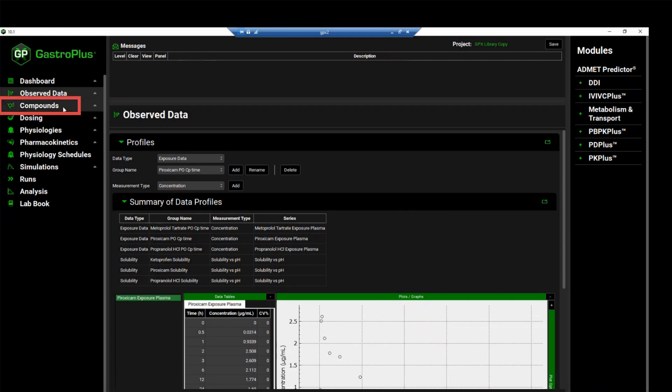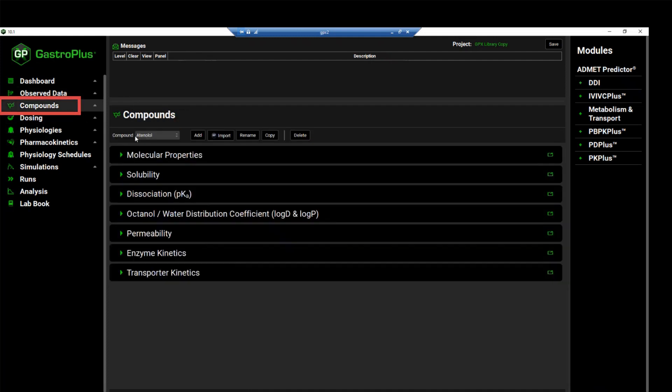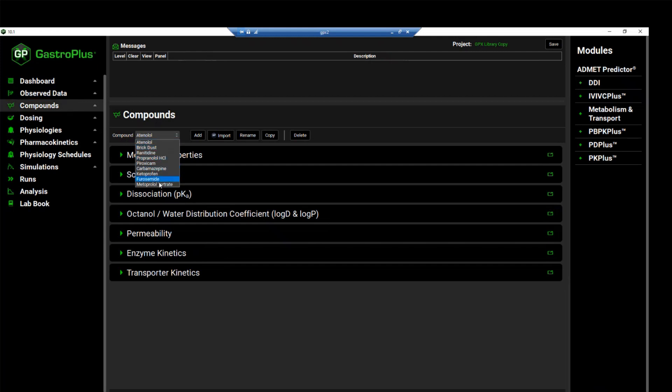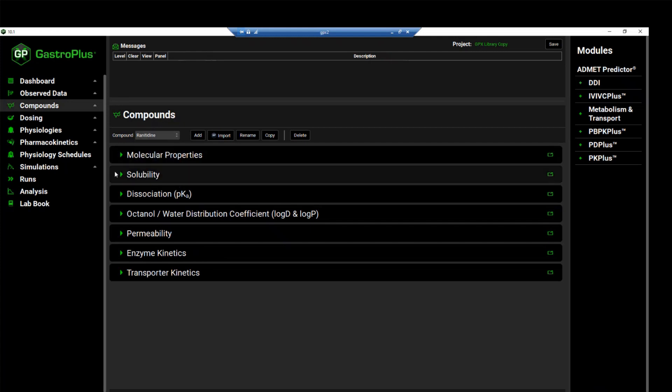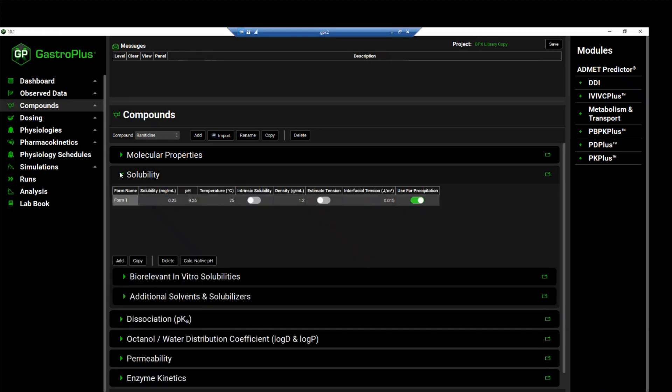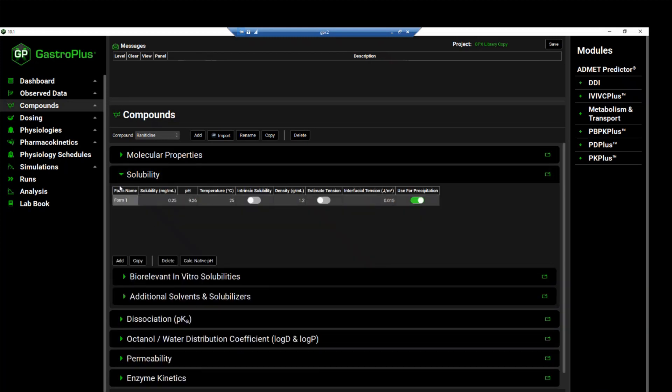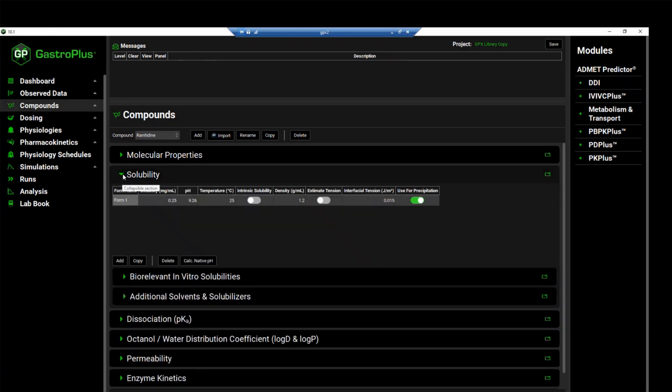Moving to the compounds view, we see that there are nine different compounds in this project. You can review the physical chemical properties of any of these compounds by clicking on it and then opening panels to analyze the properties of the compound.